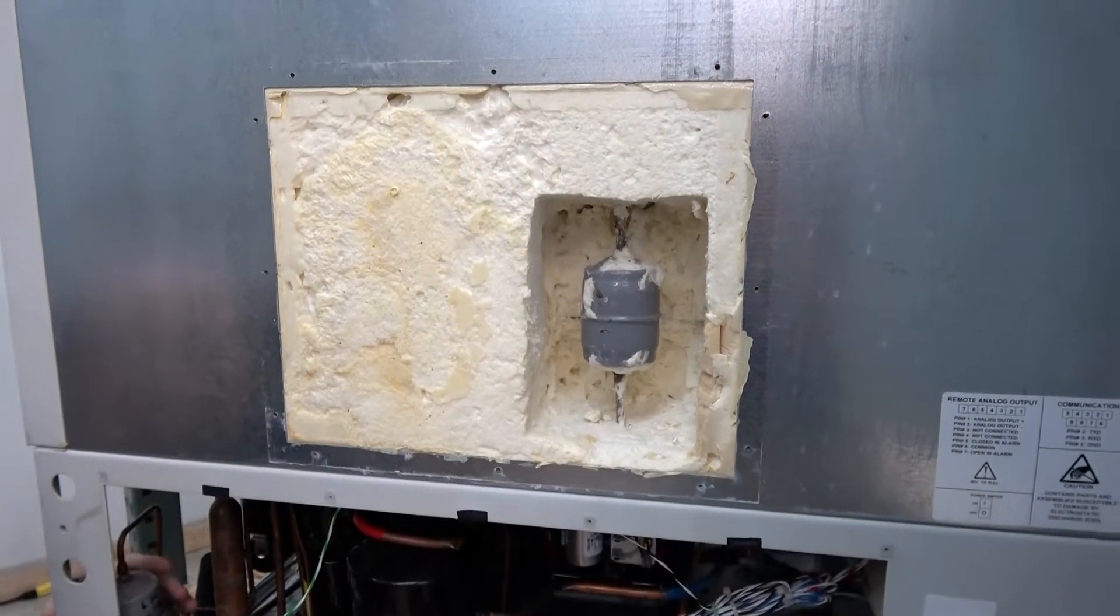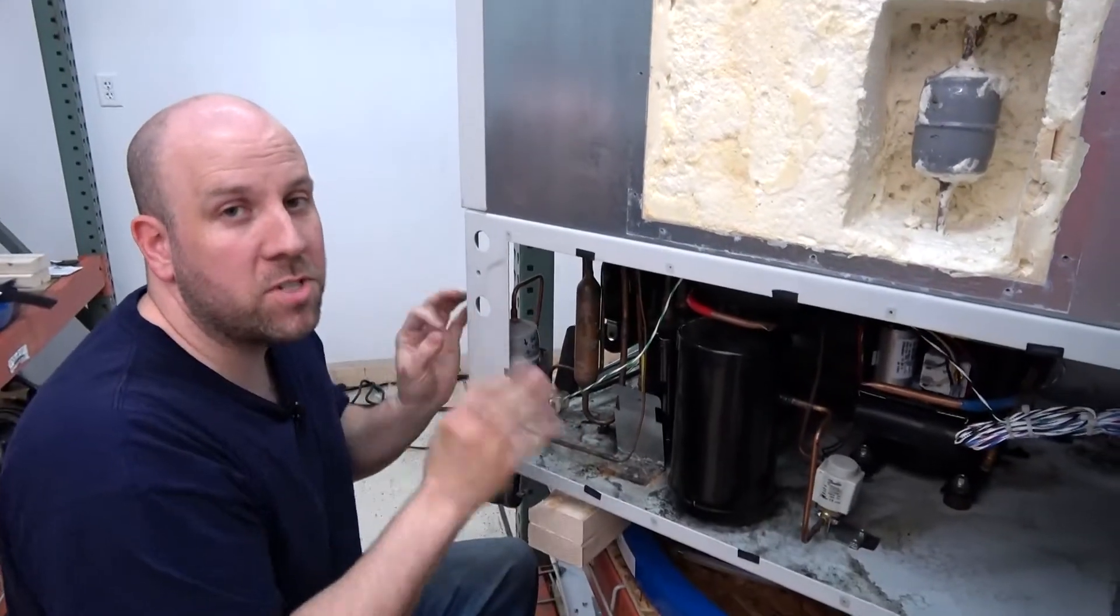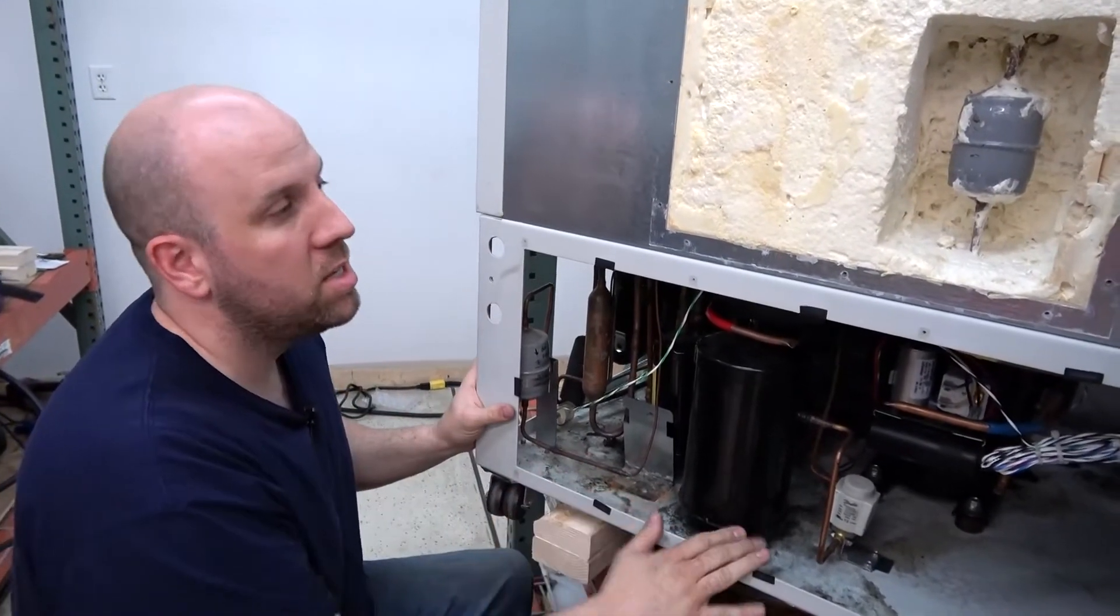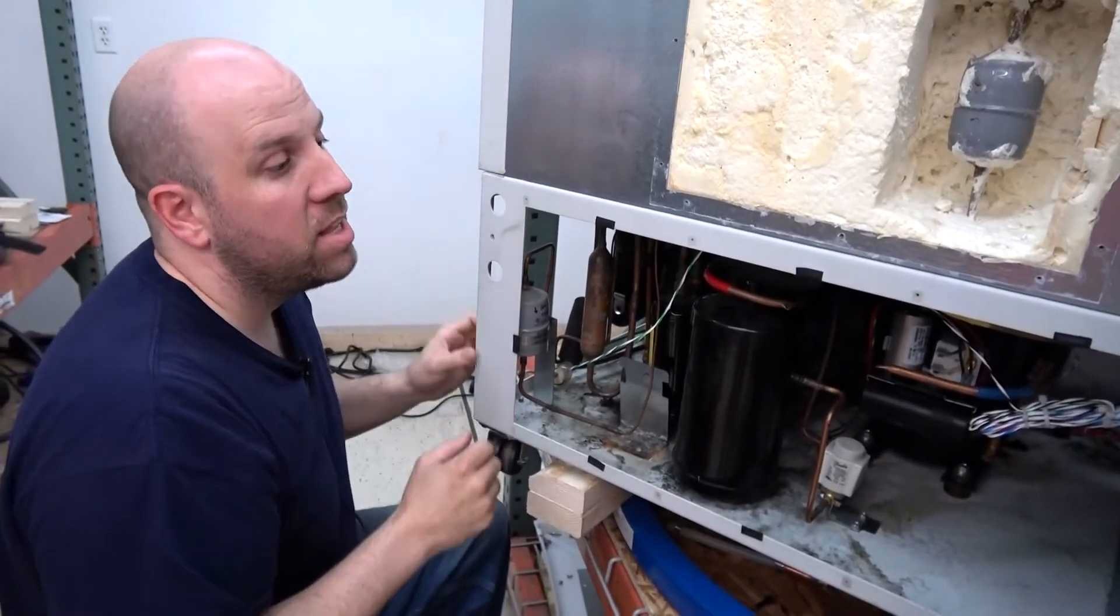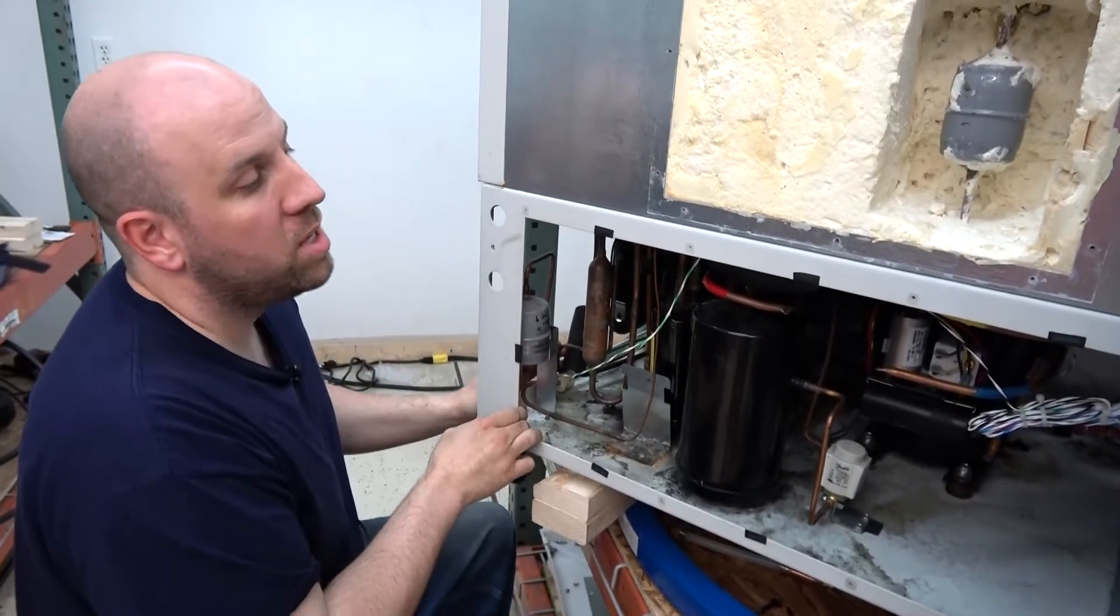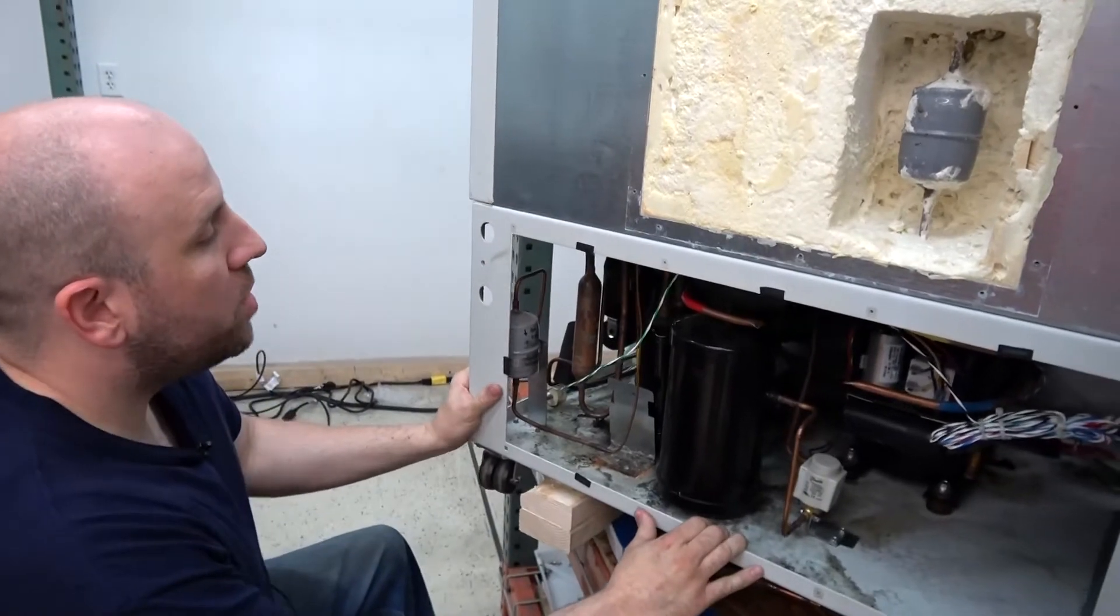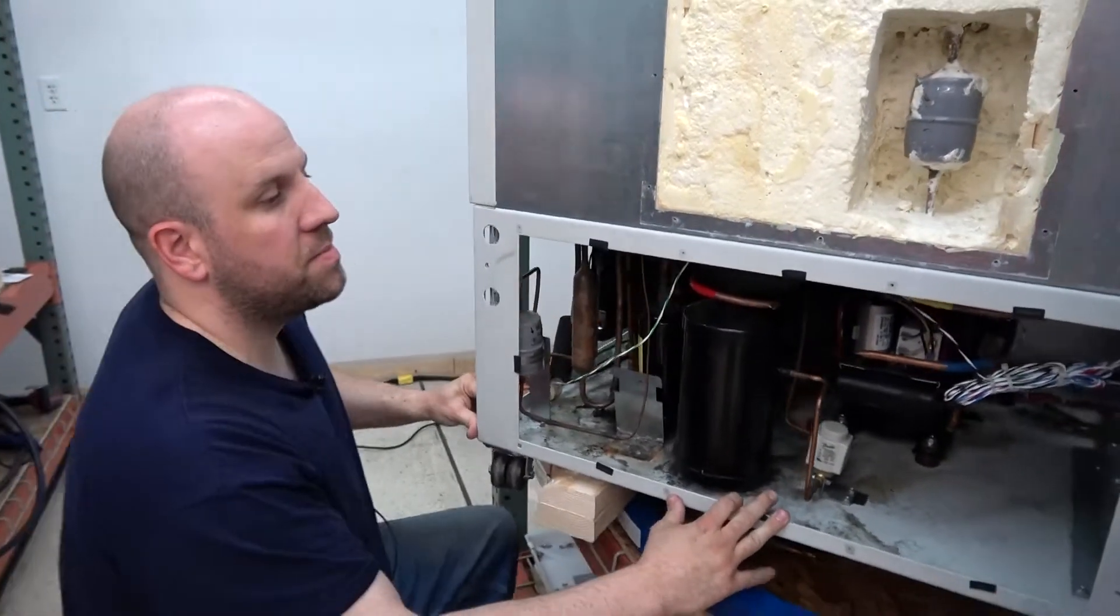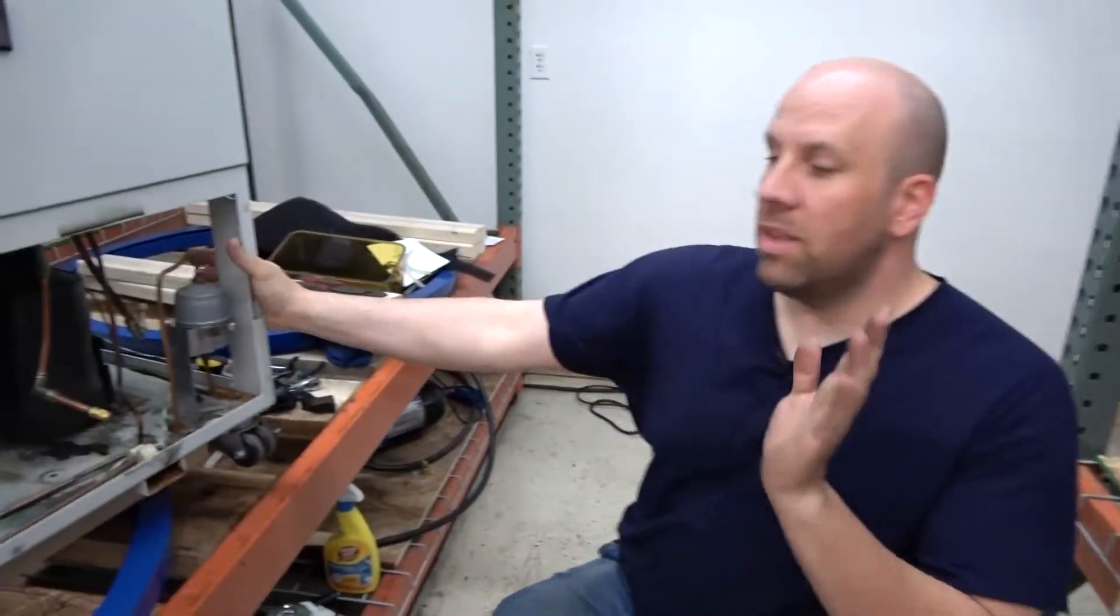Remember here, we're leaving the first stage alone because it tested good. There's no reason to cut into that. So we're concentrating on the second stage, which is the part of the freezer that is really critical and tends to have the most problems. So we take all those components out.